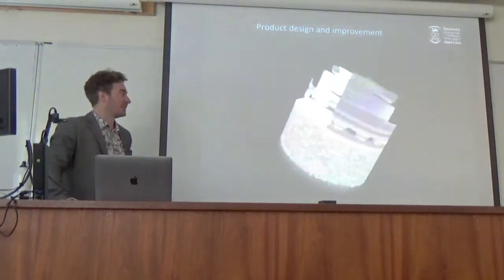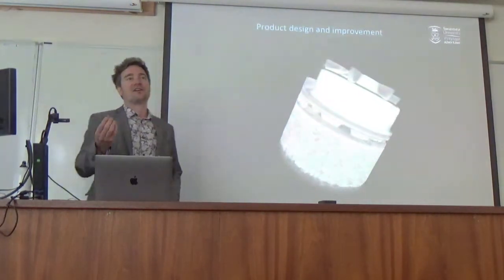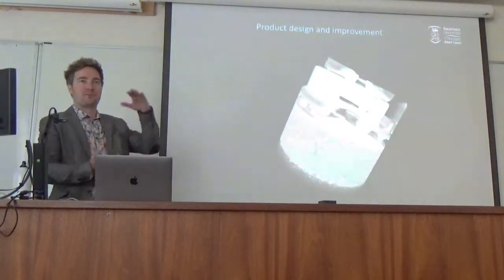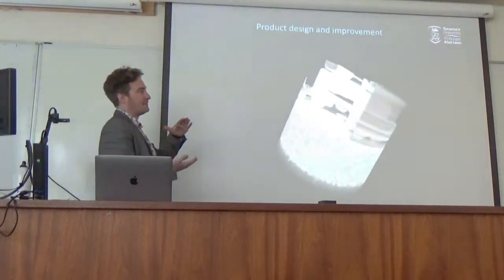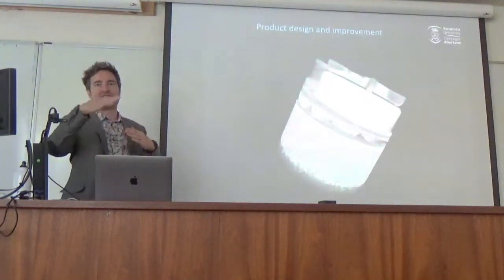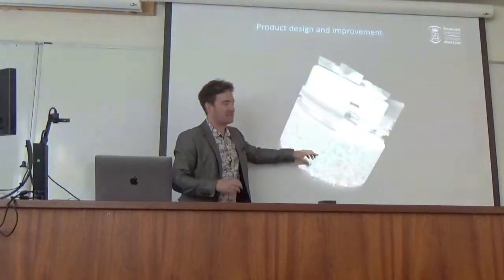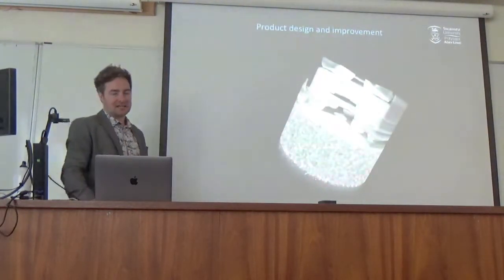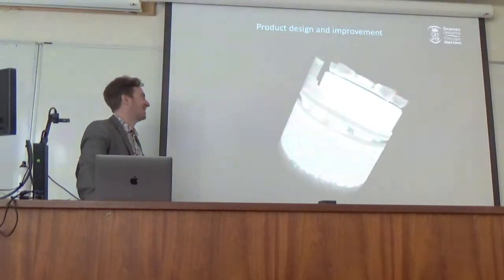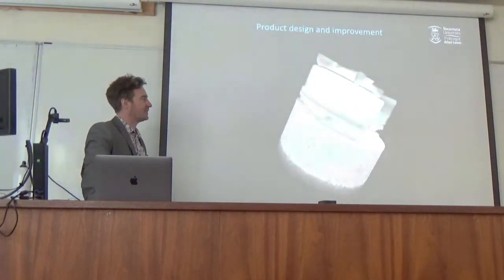This is working with a coffee company, and there's a lot of technology that goes into those coffee pods, because you're adding pressure on one side, and then you have all of these coffee granules below. We are trying to understand the fluid flow from one end to the other, and how the makeup changes as you go through the minute or 90 seconds of filtration of fluid through those granules. You'll get a change in organization of the larger and smaller grains. We're trying to understand that at the moment, and that feels like the project that's going to have most impact, right? If we can improve coffee, then at least we've done some good in the world. So yeah, still haven't got a coffee machine out of them.